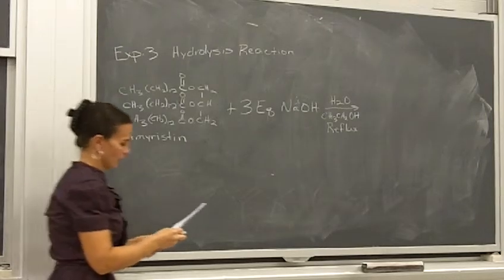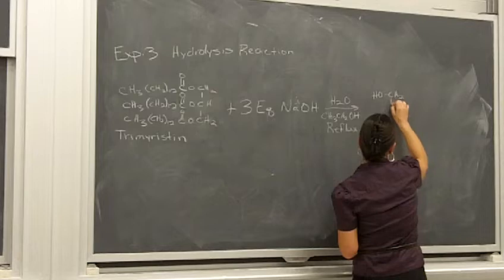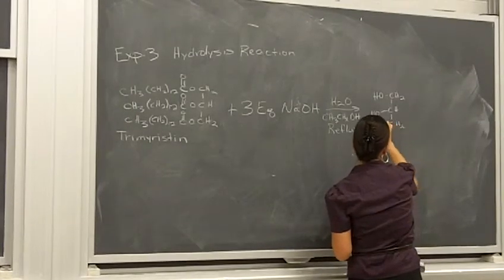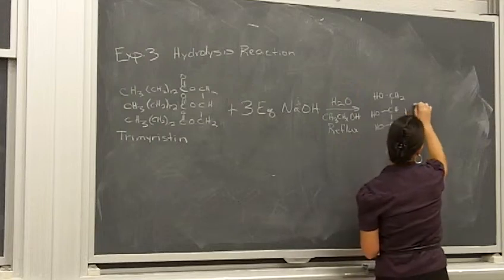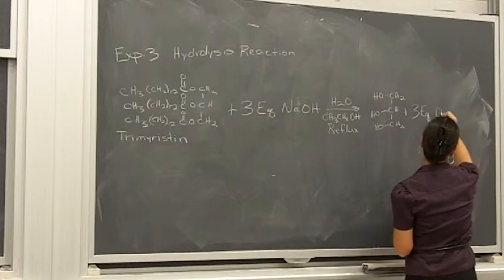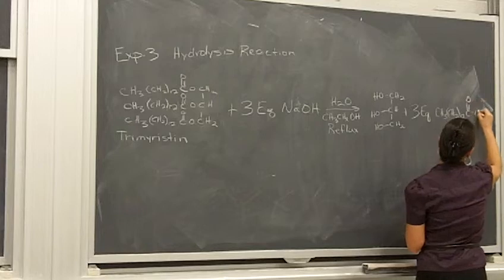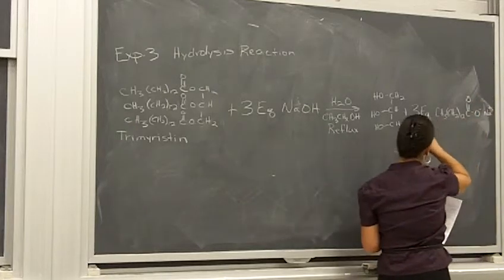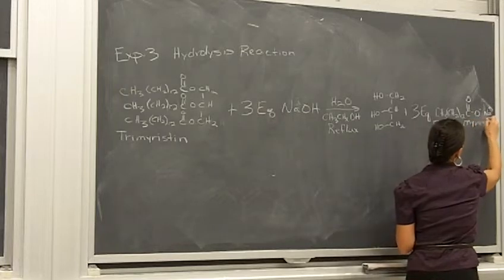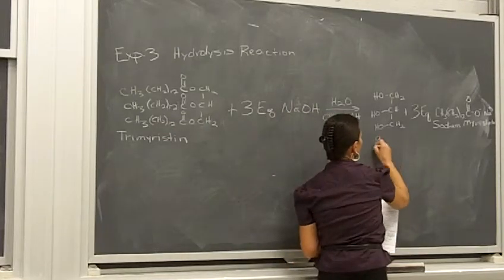So once we do this reaction, in our reaction mixture, we're going to have our glycerol, but it's not associated with our ester anymore. So we're just going to have glycerol out in the reaction mixture. And then we'll also have our 3 equivalents of our salt, okay? So it'll look kind of soapy in your reaction flask, and it should, because we basically have now made a soap, okay? So we will have our sodium myristate. It's not quite the myristic acid yet. So at this point, we've got our sodium myristate and our glycerol.